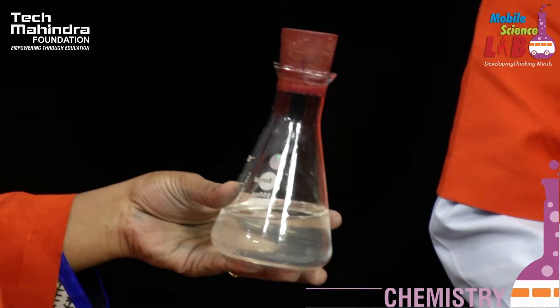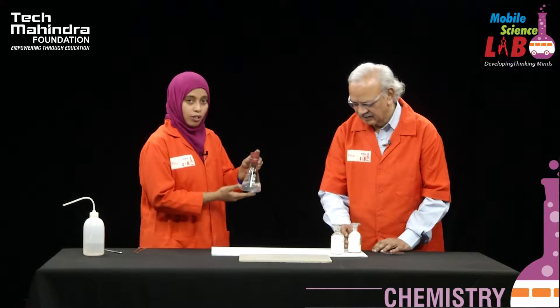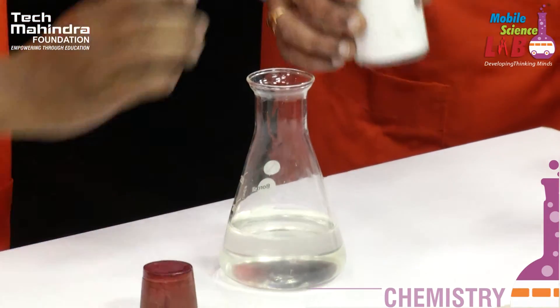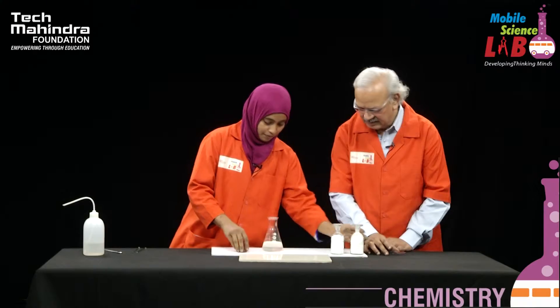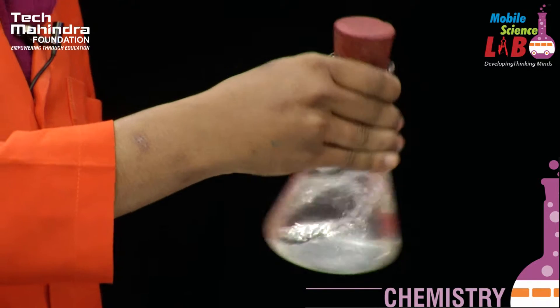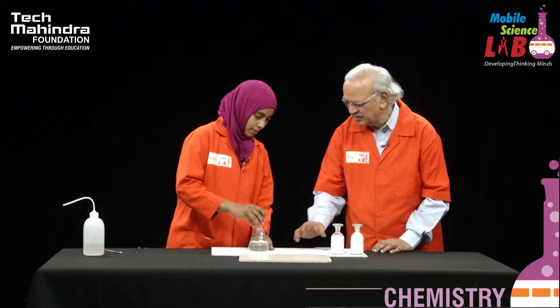Now to perform this experiment, I have already prepared sodium hydroxide solution over here. Adding the sodium hydroxide pellets will take a little time to dissolve in water, so I have already prepared the solution. I am going to add a little amount of dextrose in this and dissolve it properly. So two reagents added — sodium hydroxide and dextrose — you have prepared a solution containing both of them.